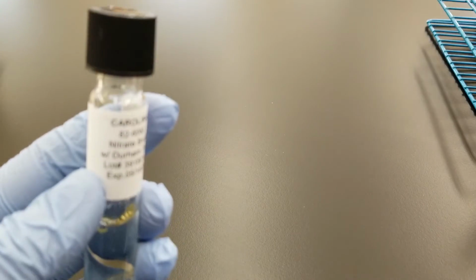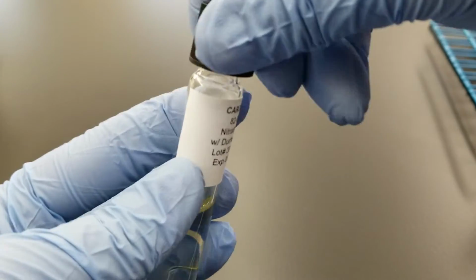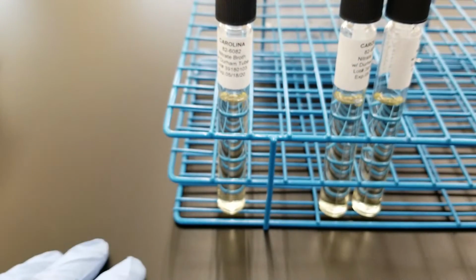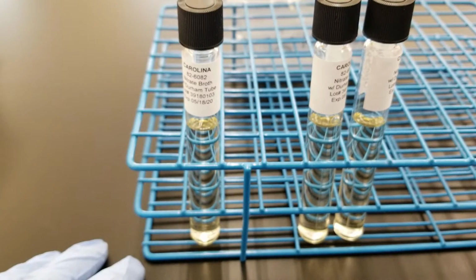Okay, so again, I don't know why you're not focusing. There we go. We're going to tighten it all the way and then loosely undo the cap. All right, these are going to go again in the non-CO2 incubator for 24 to 48 hours.